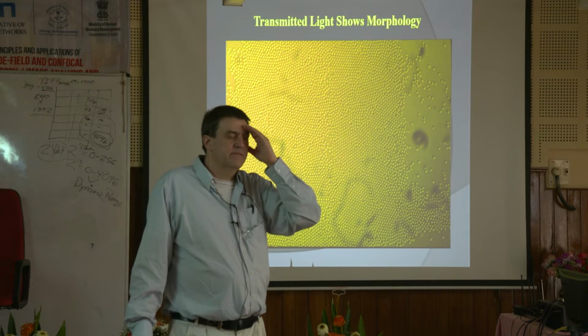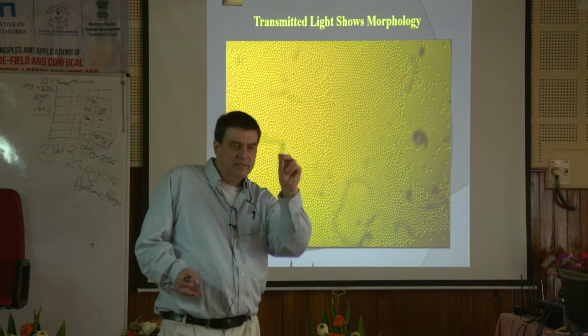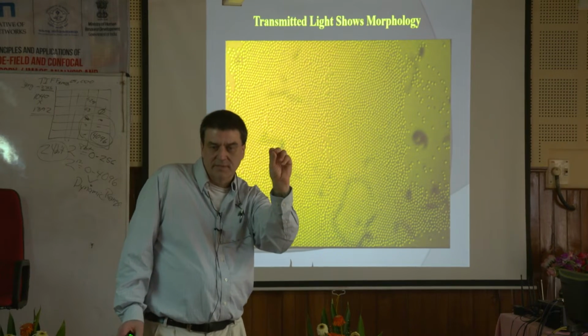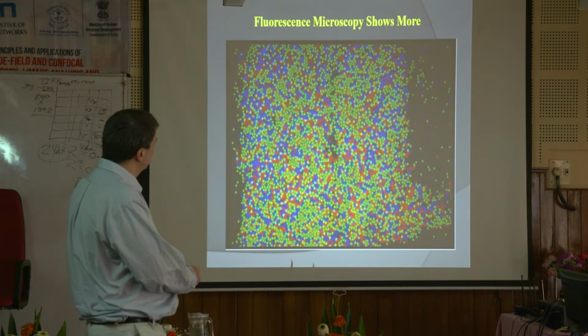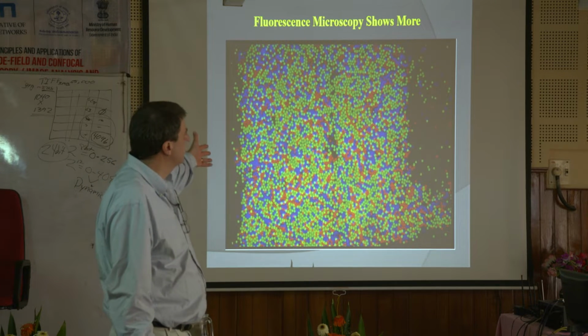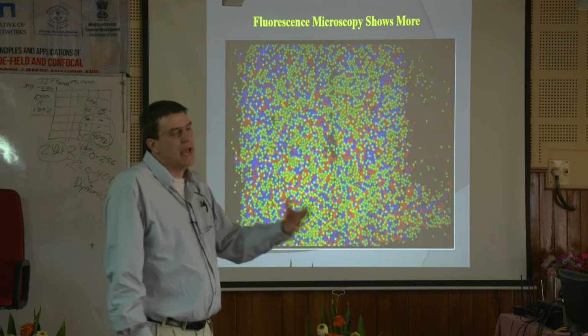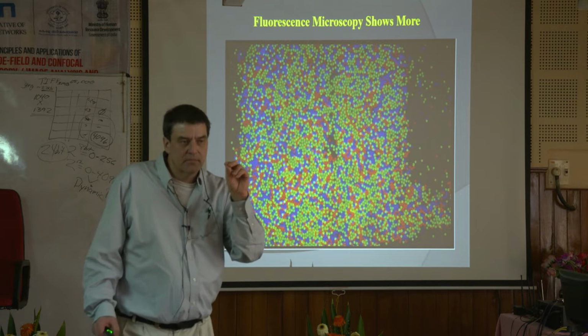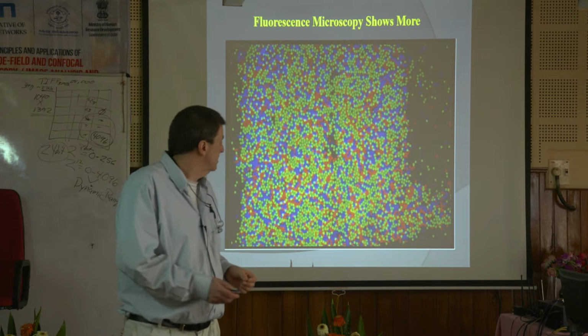And like on the first day, I remember he talked about the people in the stadium, and you'd see one person had a green dot or something that was fluorescent, right? Well, here, if you just look at fluorescence, and we assign them different colors, there's an awful lot more to see, okay? It can bring out a lot more detail. We can use tags. We can basically isolate a molecule to look at using fluorescent techniques.